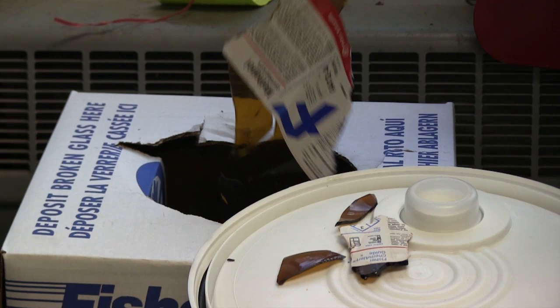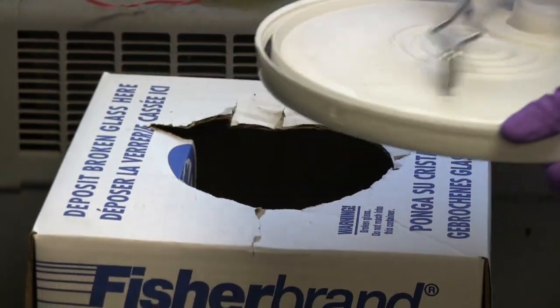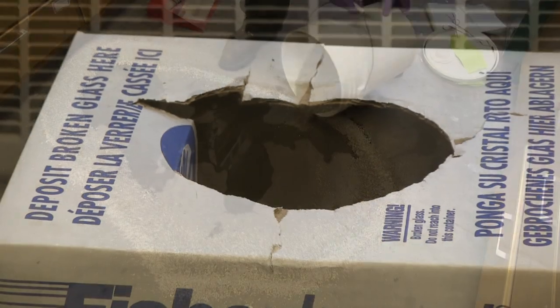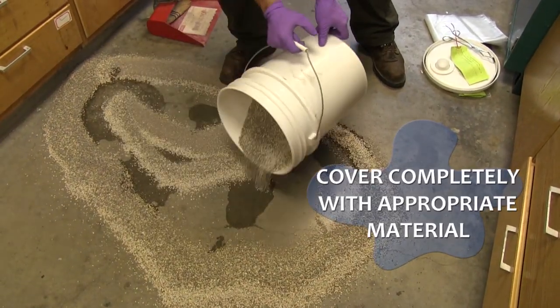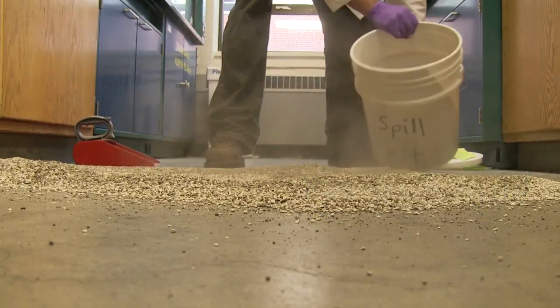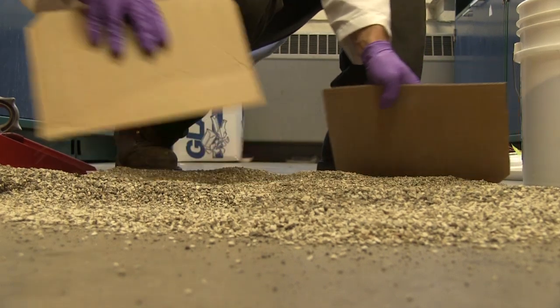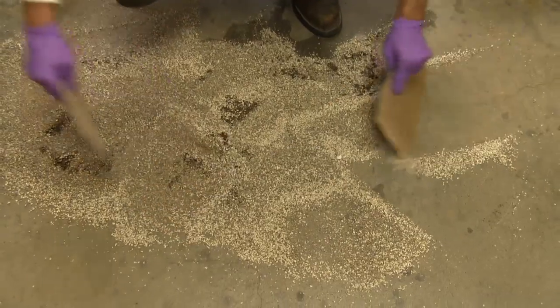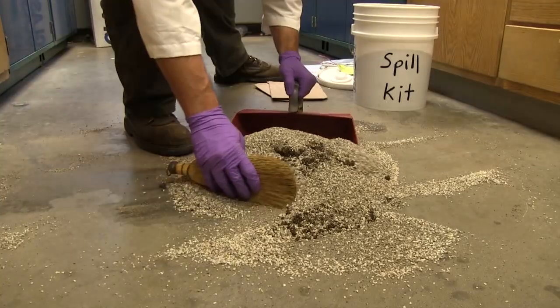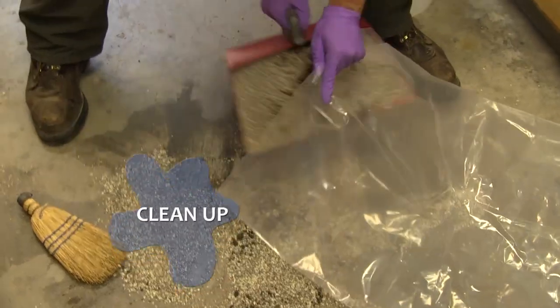Place any broken glass into the laboratory glass collection container. Slowly work from the outside in, placing floor dry onto the spilled material. Wait a few minutes, allowing the spilled chemicals to absorb. Slowly mix the floor dry and sweep up the material. Put the used floor dry into a plastic bag.